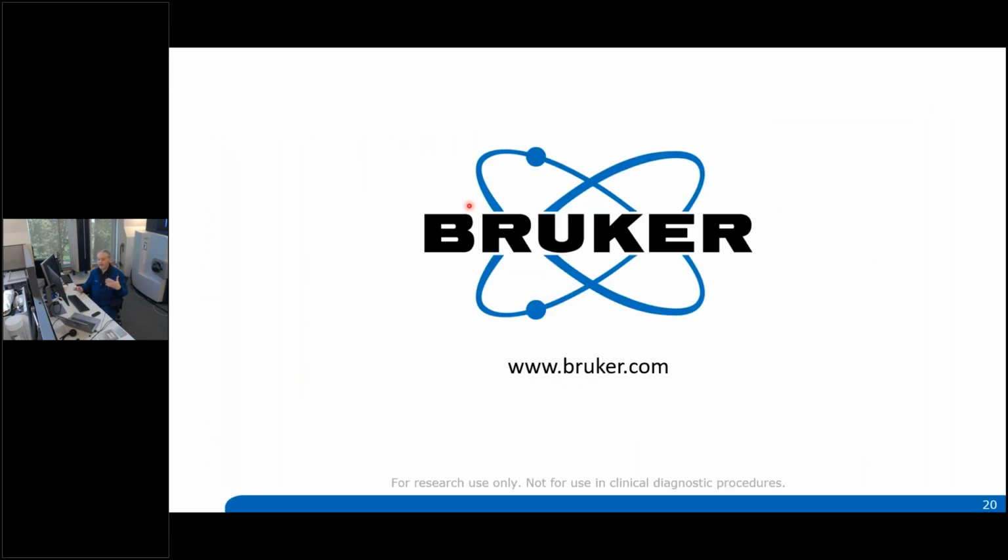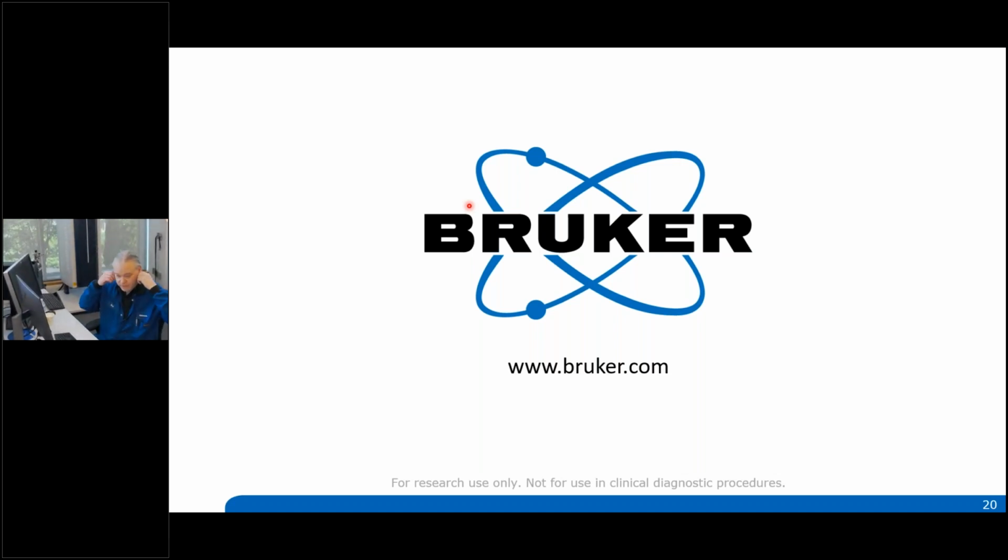Now, with that, I would like to move into the actual data acquisition and then the workflow in the software and give you an idea of what it is that we do. So what I'm going to do is step out and put the target in the instrument. So I'm just going to show you the front of the instrument while I do this.